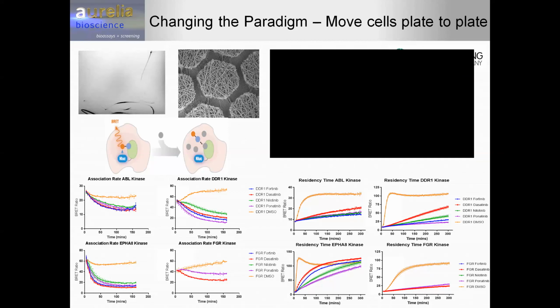What we're showing on the bottom here is the ability to do that by first soaking the cells, which are on scaffolds, in the tracer, then taking them out while they're on the scaffolds, washing them in, let's say, a PBS wash, and then putting them into a well that contains, in that case, the compound, or vice versa.